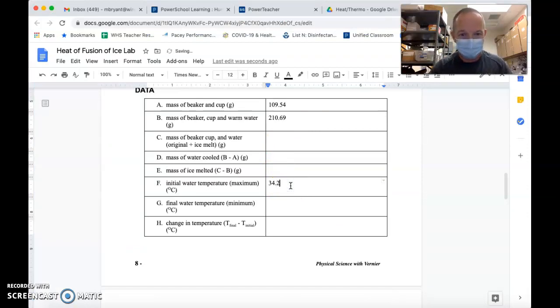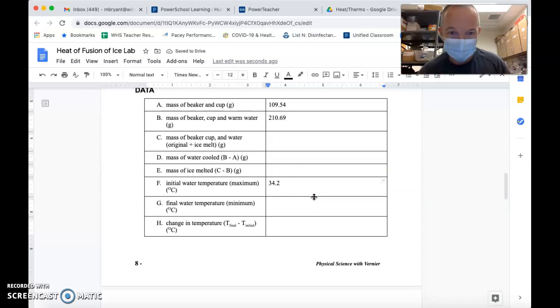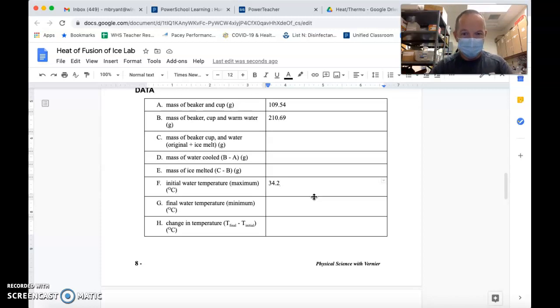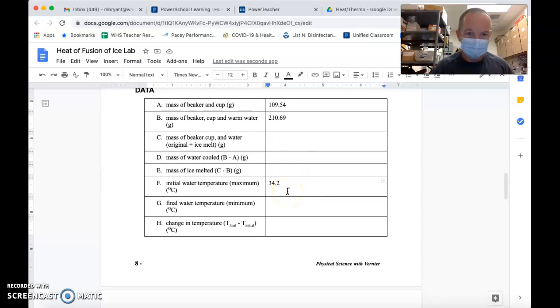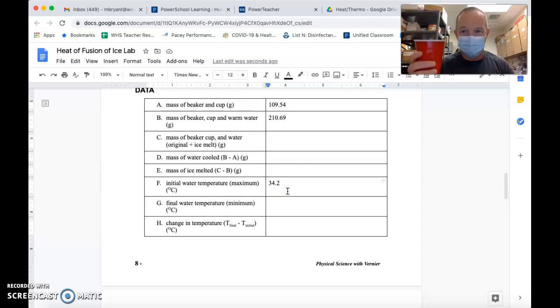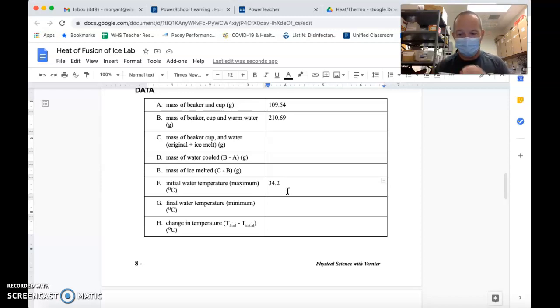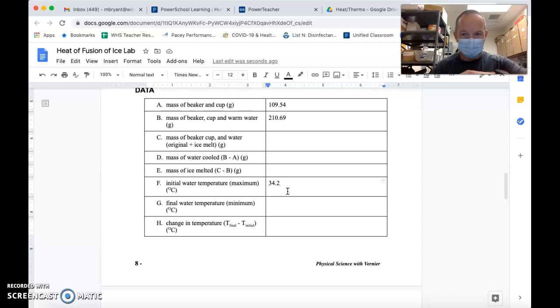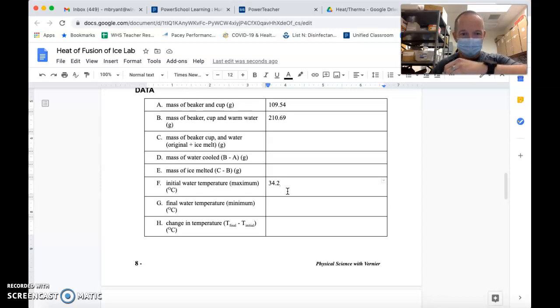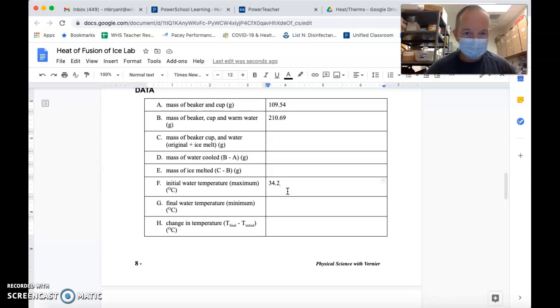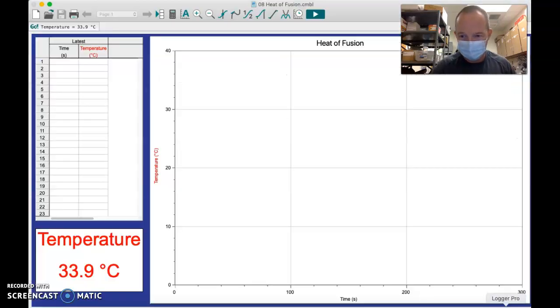Okay, so it looks like we've leveled off here at about 34.2 degrees Celsius. I'm going to enter that as the initial water temperature. We've started with warm water. The procedure recommends about 30 degrees Celsius, so I went a little higher in the interest of time. We start at 34.2 degrees Celsius. We're going to add a handful of ice. I used my privilege as a coach to go get the sweet crushed ice from Kevin's office, from our trainer's office, and I'm going to use a chunk of this to cool this water down.